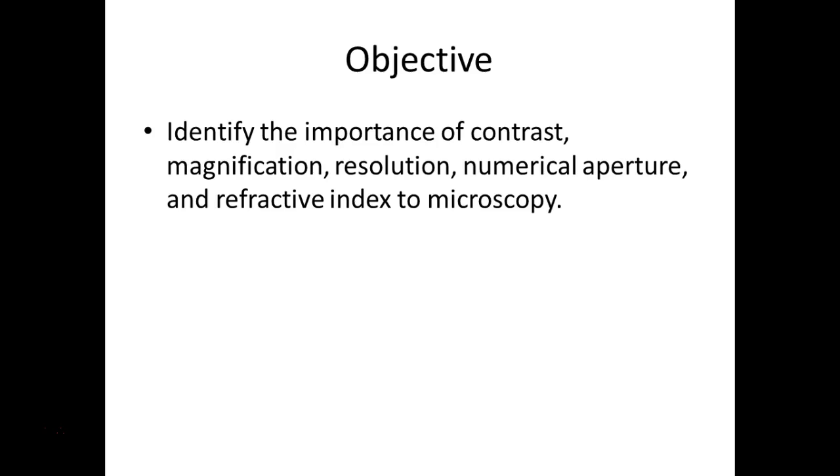So just to give you an idea, when I was at LSU vet school working there in research, they had one of these microscopes, a laser microscope called a confocal. It uses a laser to take multiple images, basically slicing through the specimen. Of course, you're not actually seeing what it's seeing. The laser's generating a computer image. But because of the laser and because it gets so hot, this particular microscope was within a room.